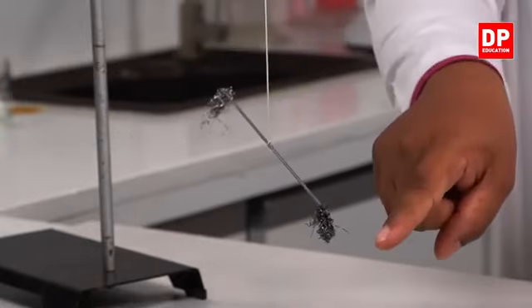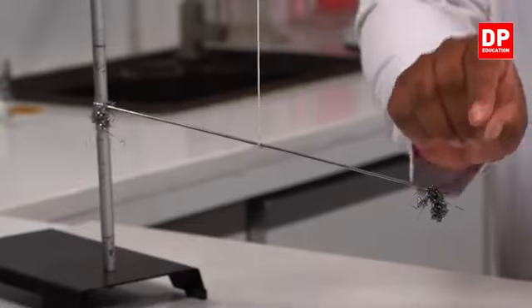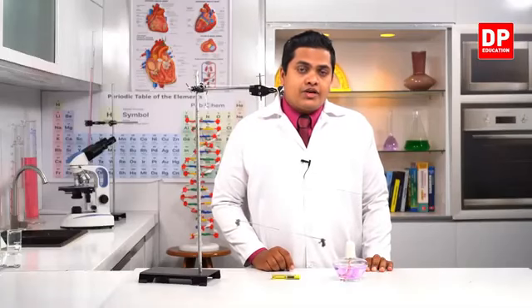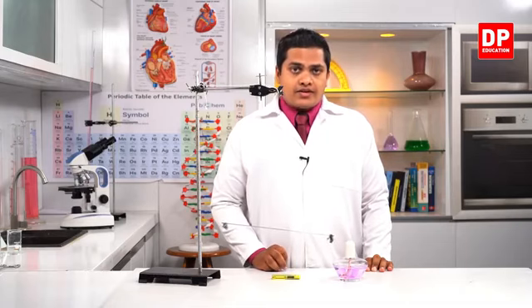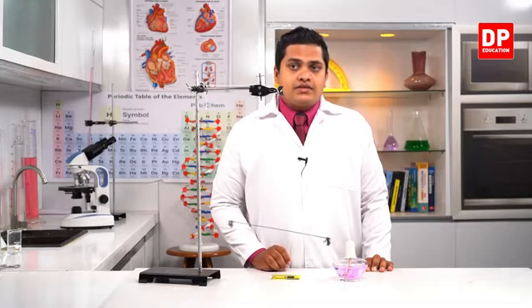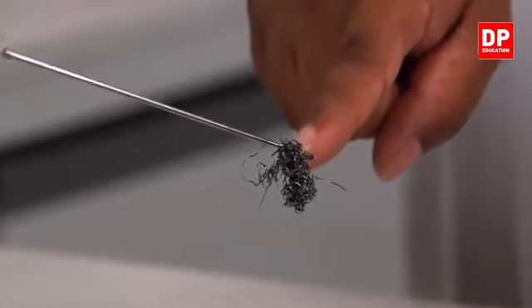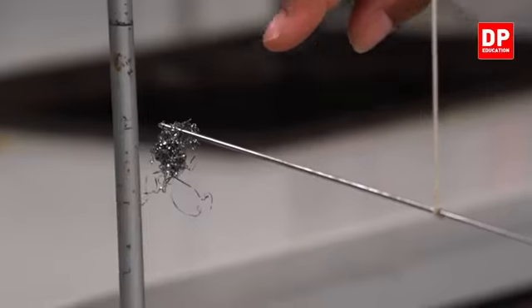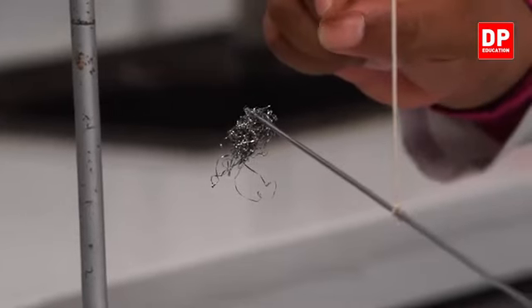It's because after I burned this end, now this end has iron oxide. In the earlier case also I told you that if I burn something, oxygen gets reacted with the substance. So due to that, the color of this one has changed. This end, we can observe iron oxide. And here, this other end, you can observe it still has a shiny surface, unlike the other end.